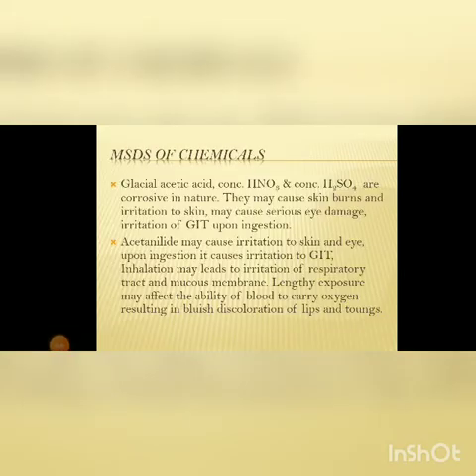So here is the MSDS of chemicals which we have used in this synthesis. Glacial acetic acid, concentrated HNO3 and concentrated H2SO4 are corrosive in nature. They may cause skin burns and irritation to skin, may cause serious eye damage, and irritation of GIT upon ingestion. Acetanilide may cause irritation to skin and eye. Upon ingestion, it causes irritation to GIT. Inhalation may lead to irritation of the respiratory tract and mucous membrane. Lengthy exposure may affect the ability of blood to carry oxygen, resulting in bluish discoloration of lips and tongue.